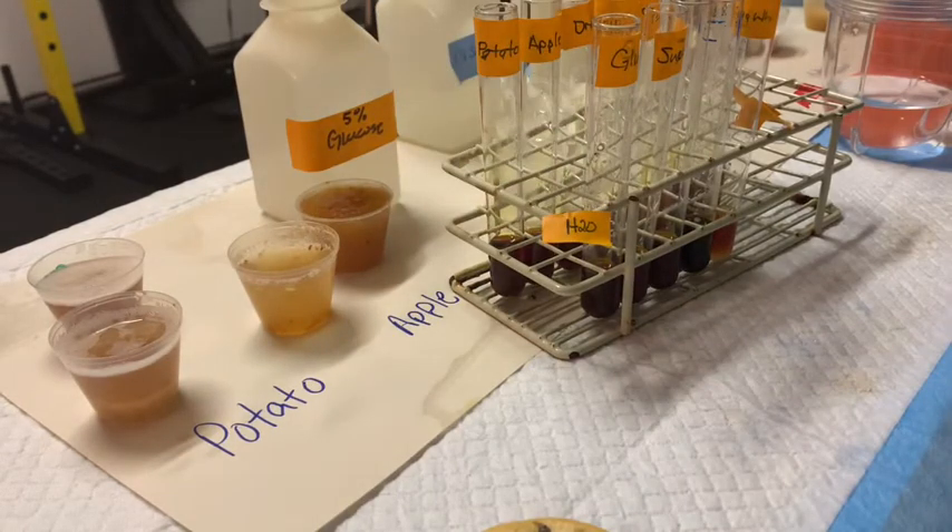I'm going to put my labels back on my tubes, clean up the tubes, and then we're going to move on to the third assay in this laboratory — the Benedict's test for a reducing sugar.